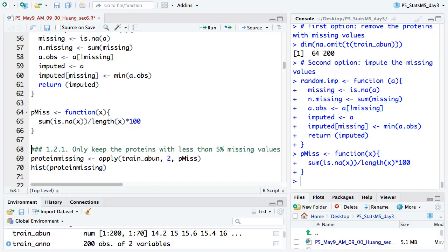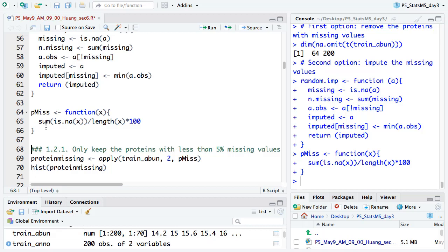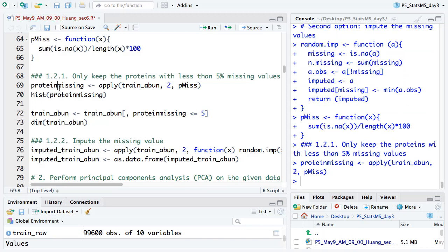When the percentage of missing value is very small, I usually use the minimum value to impute, based on my experience. But if the percentage is very large — especially for a specific protein — I will remove that protein rather than impute it. For this case, if we see around the function here, it will tell you for each protein what's the percentage of missing value, so you can make an informed decision.